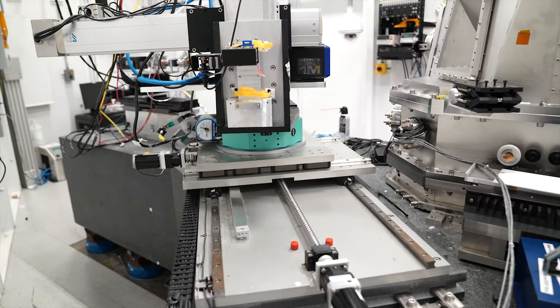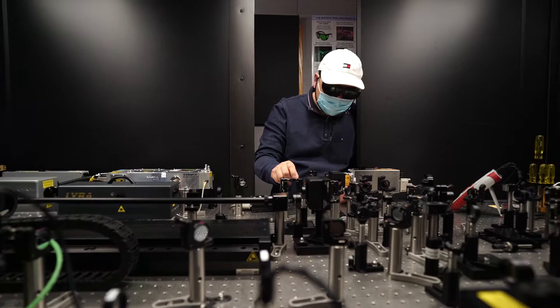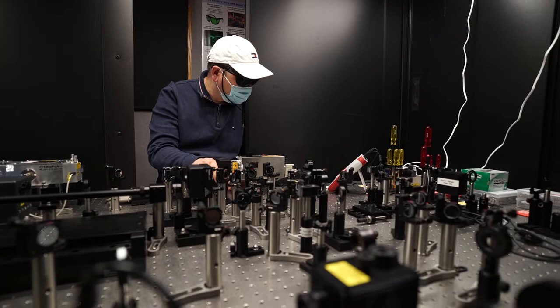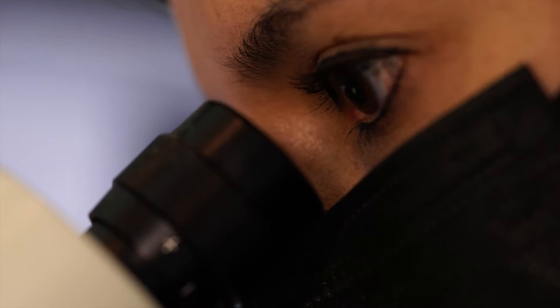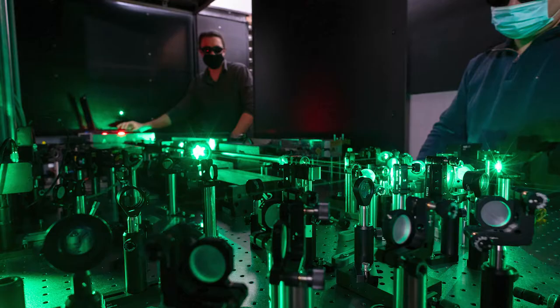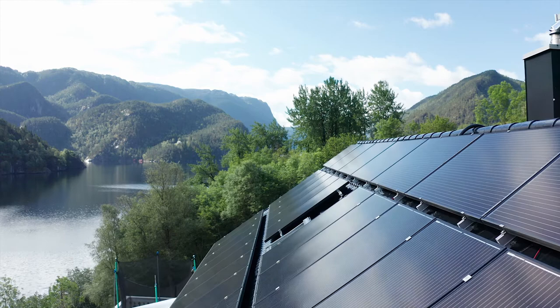structure and chemical makeup. CNM's Ultra-Fast Electron Microscope, or UEM, uses ultra-fast laser pulses that act like a high-speed camera. It can capture tiny details happening in a trillionth of a second, and can reveal how light interacts with different materials. Understanding light-induced processes can lead to more efficient solar energy harvesting and bio-inspired materials.